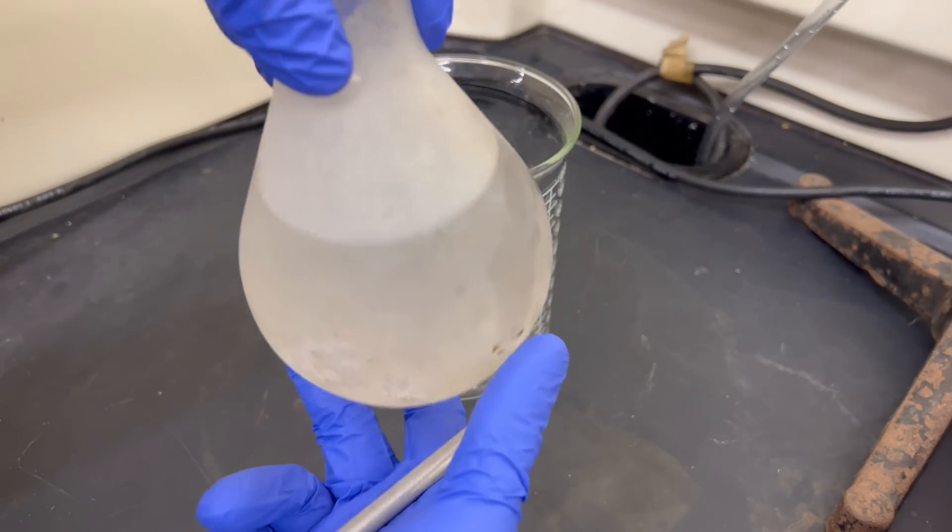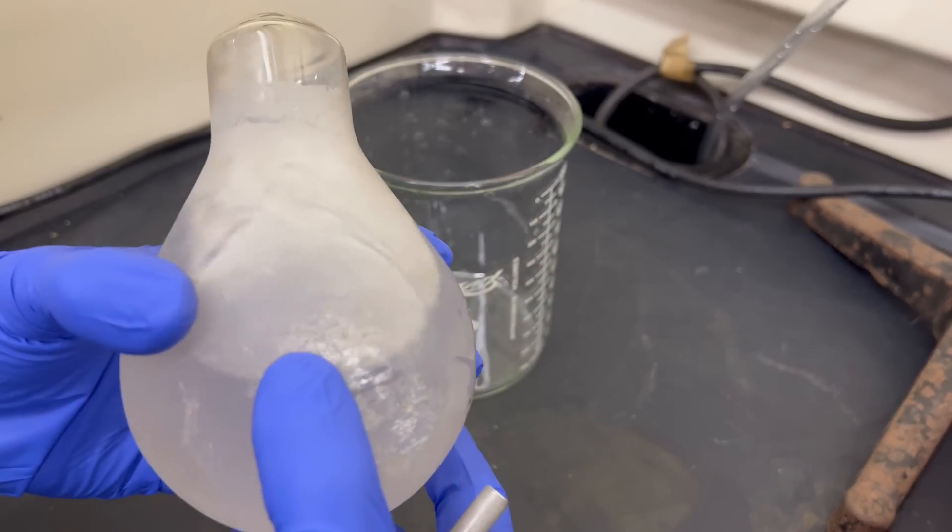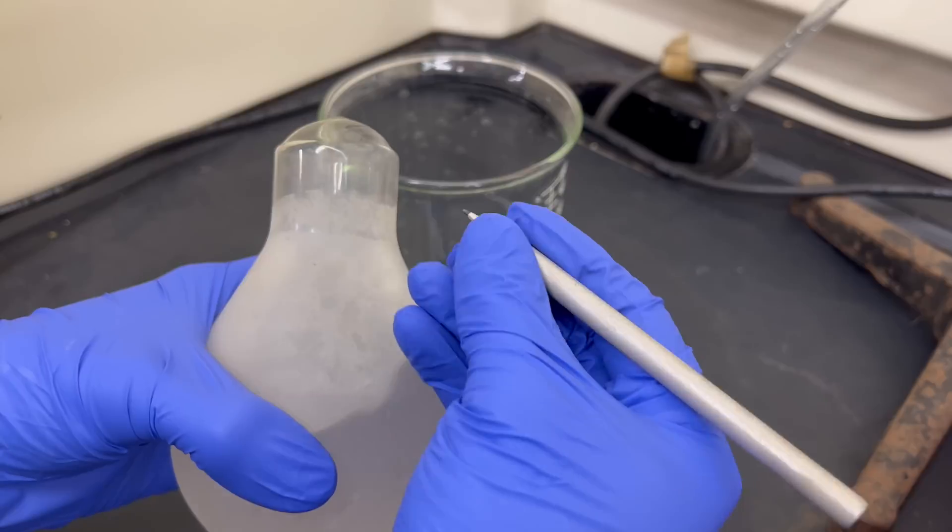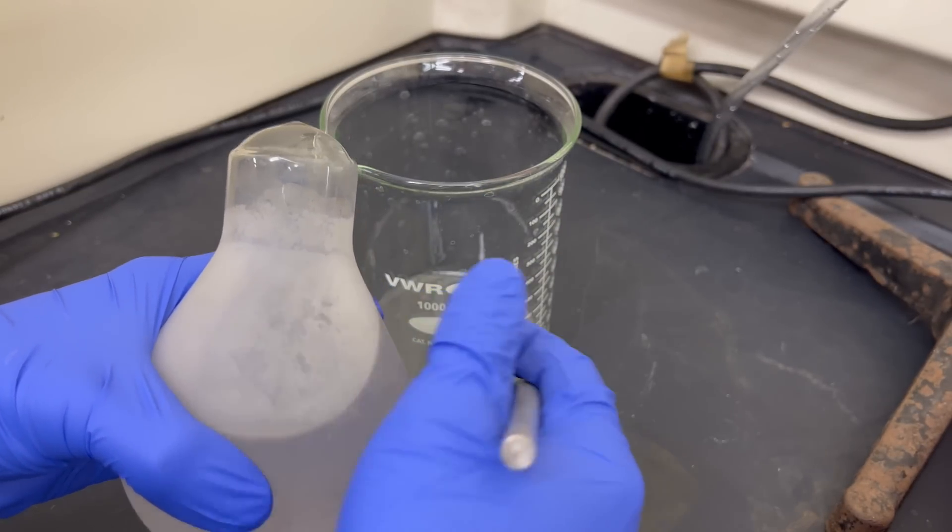These fire extinguisher grenades are made out of relatively thin glass, so my plan is to use a tungsten carbide knife and to score the top of it.